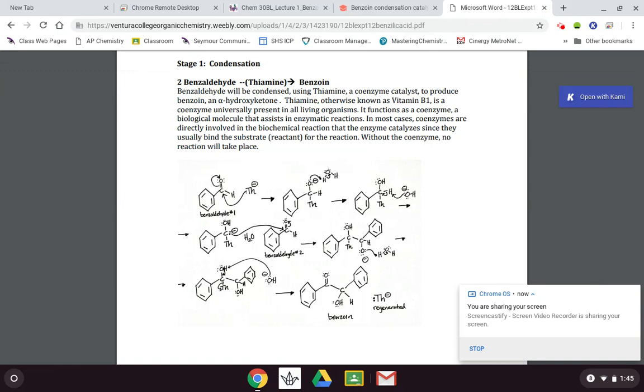You can see it's really just 4 ingredients, and let it cook. The keys here are you cannot let it get above 20 degrees Celsius in the first part, and in the hot water bath it has to be between 55 and 65 degrees. You have to try to regulate the temperature of that water between 55 and 65 for an hour and a half. So that's what it's going to be.